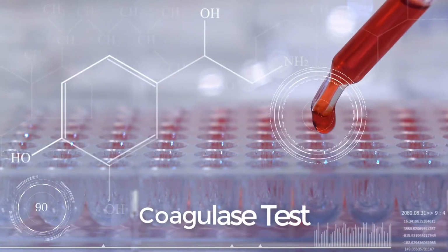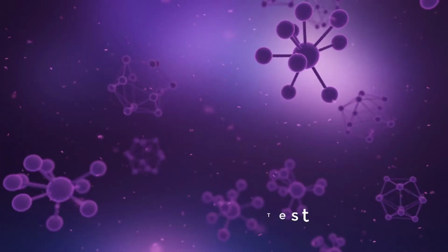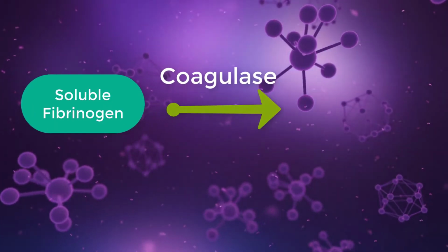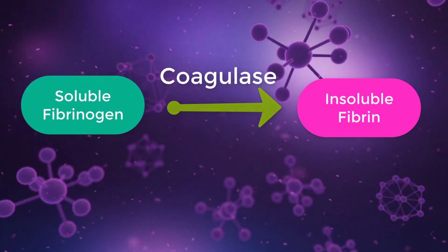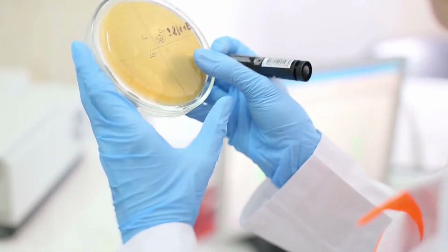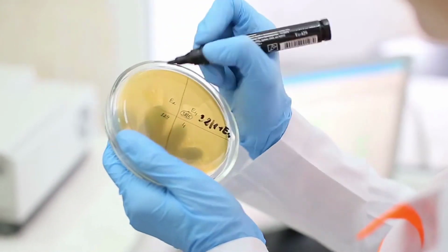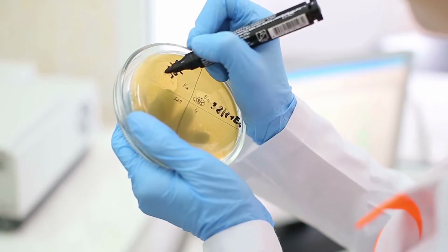Our next test is the Coagulase Test. Coagulase is an enzyme produced by Staphylococcus aureus that converts soluble fibrinogen in plasma to insoluble fibrin. Other Staphylococci do not produce coagulase. Thus, this test can be used to distinguish Staphylococcus aureus from other strains of Staphylococci.